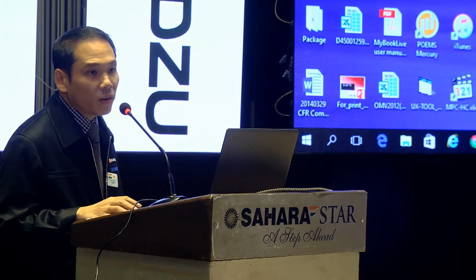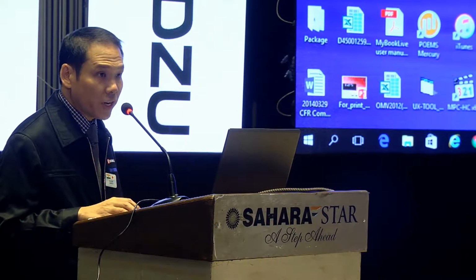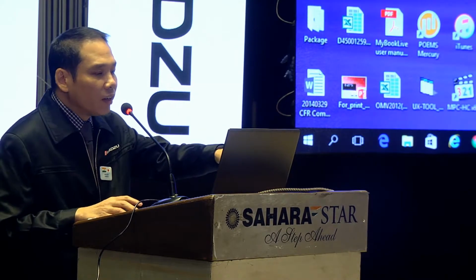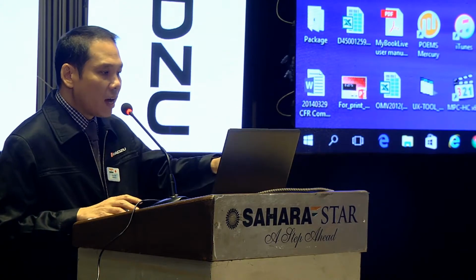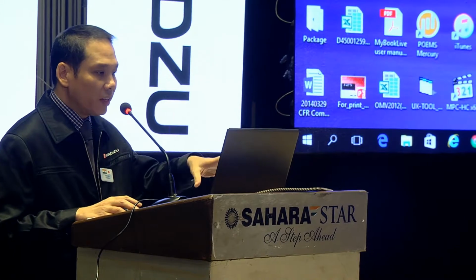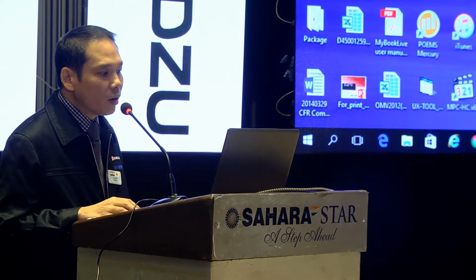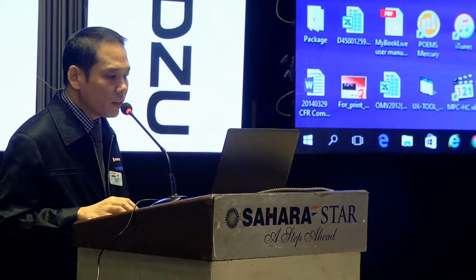Okay. When you log in to the Lab Solution DB, first you need to select the project. So this project, okay, you can also use the Lab Solution DB Manager to create as many projects as you want. So I've already created a project named Balance.